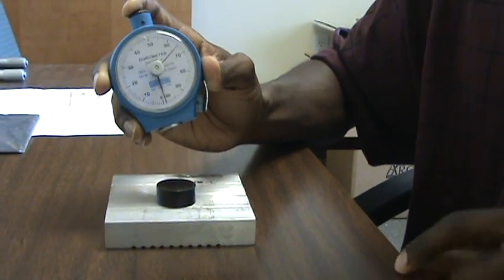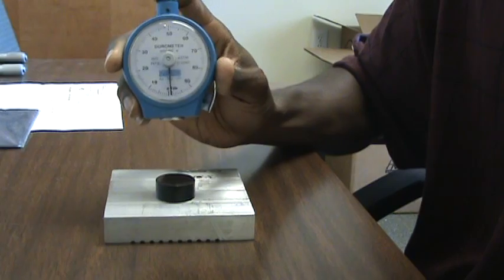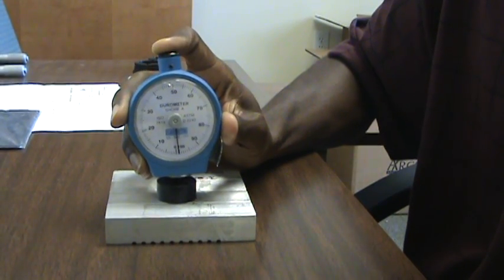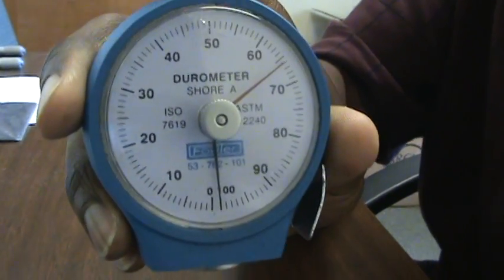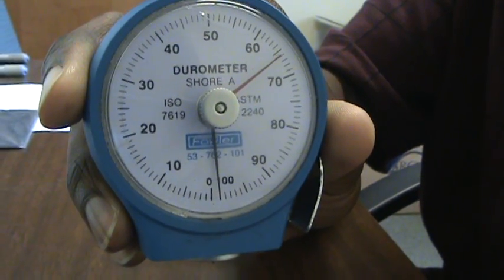I will check it again to verify. Turn the knob to bring the red dial back down to zero and firmly press against the button again. As you can see, the part reads 66 durometer Shore A.